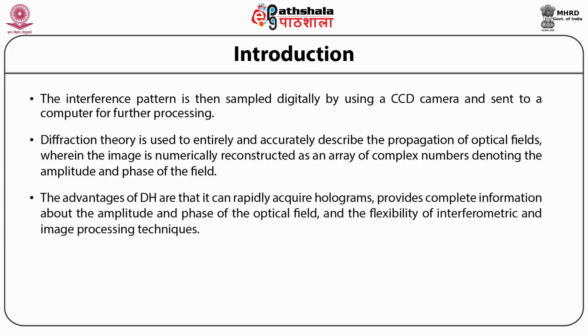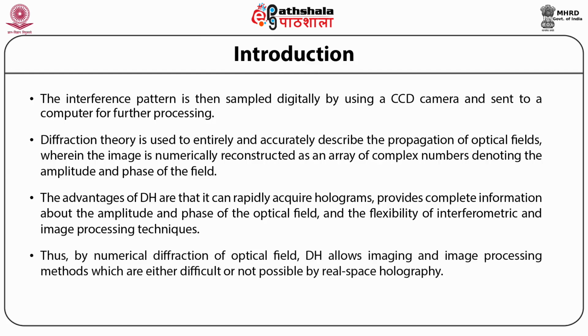The advantages of DH are that it can rapidly acquire holograms. It provides complete information about the amplitude and phase of the optical field, and the flexibility of interferometric and image processing techniques. Thus, by numerical diffraction of the optical field, DH allows imaging and image processing methods which are either difficult or not possible by real space holography.